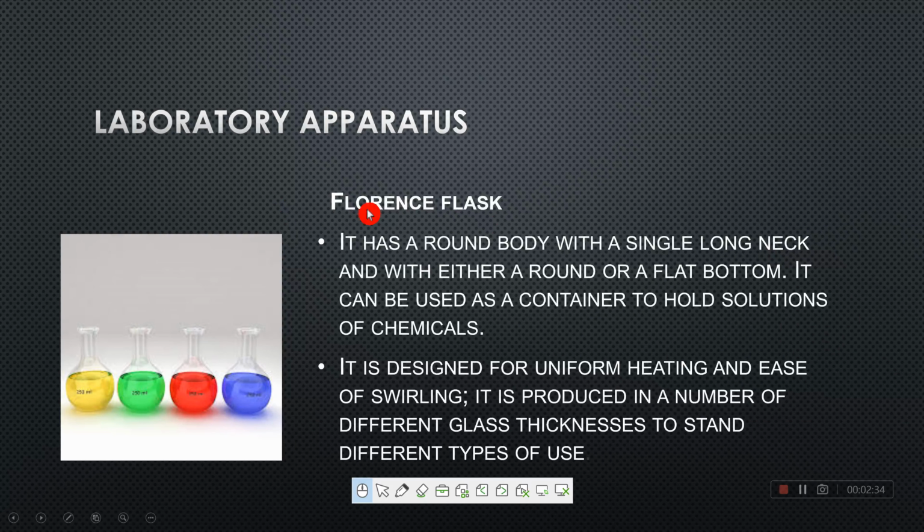Next is the Florence flask. Here you can see in this picture, these are the Florence flask. It is named the Florence flask. The Florence flask has a round body. You can see in the picture it has a round body with a single long neck. It is open from one side at the top and it is round or flat at the bottom.